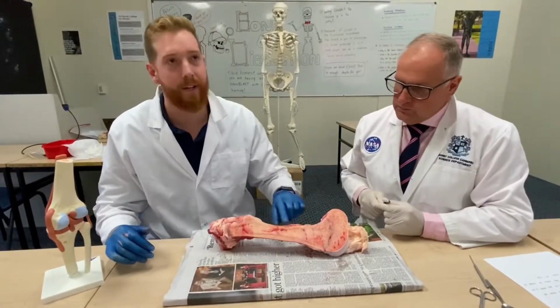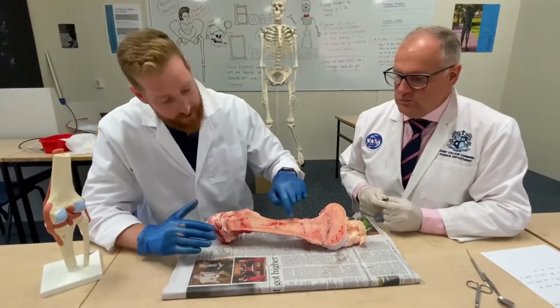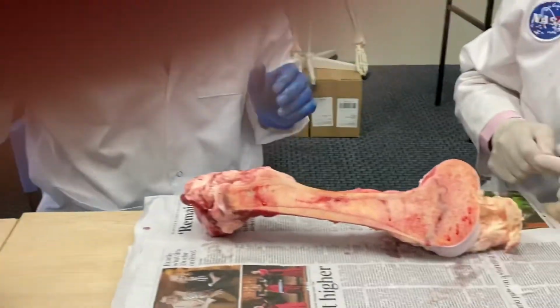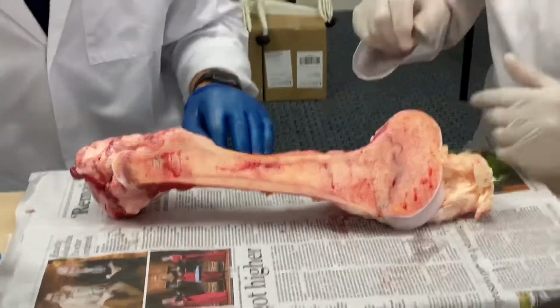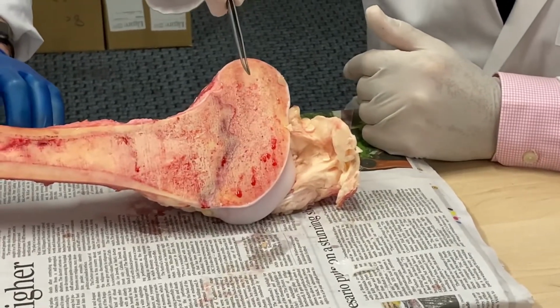Okay, so now we're going to be looking at the diaphysis of the bone. So we know that it forms the compact part of the bone. So as you can see here, and then on our knee here, it is the compact part. So that is the tough, firm part of the bone, also known as the shaft. And then we go to the spongy or cancellous bone. So you'll see 2 terms to describe this.